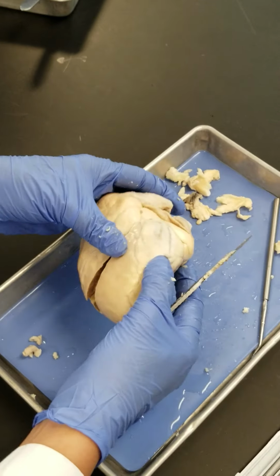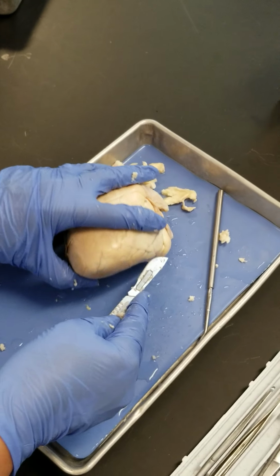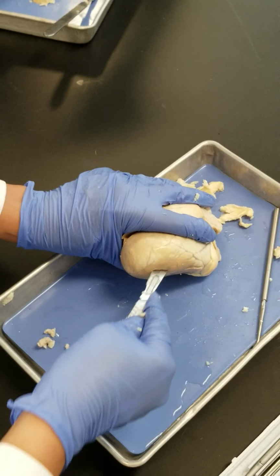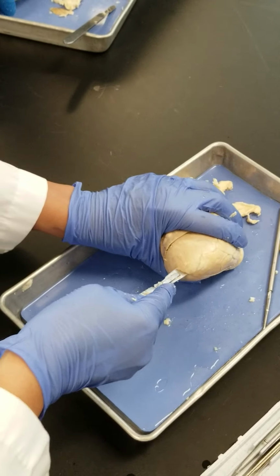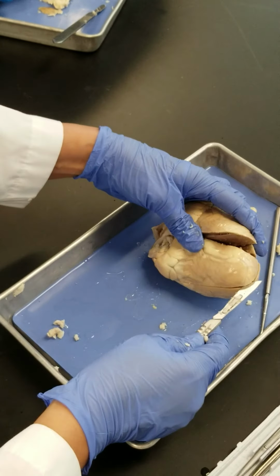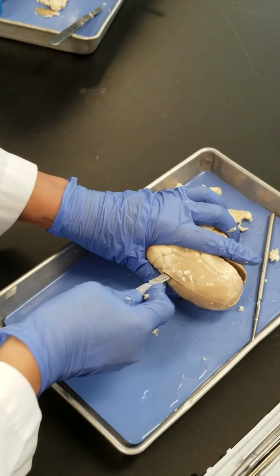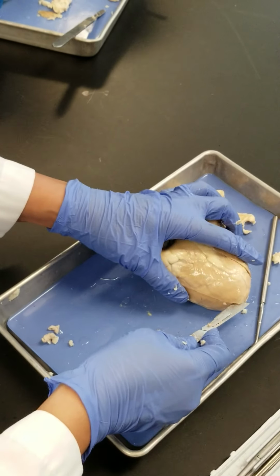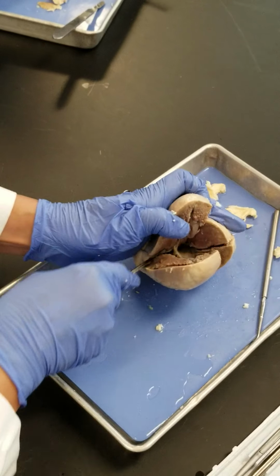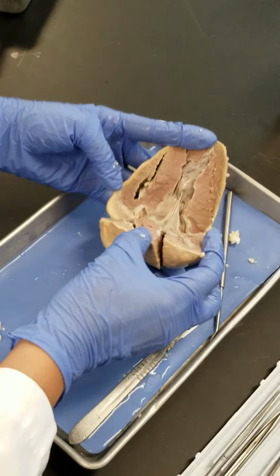If I cut the left ventricle too, just the right ventricle, in the frontal or coronal plane, like this one, right? We cut the left ventricle too to get it here. Yeah, the right one. Along the same plane as that. Even that little bit right here is actually a lot of fat. Oh, yeah. You're right. That makes sense. Now that explains it, when I open this one, look at this.